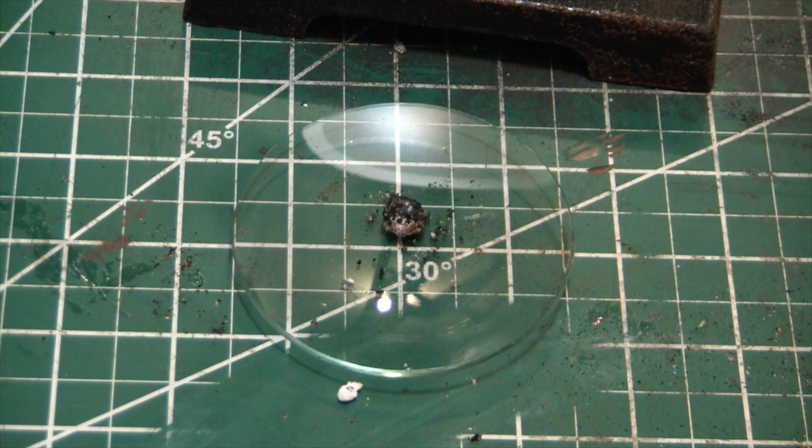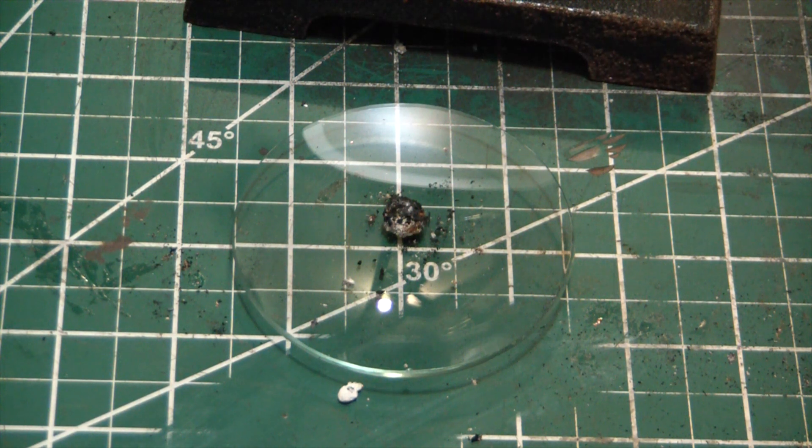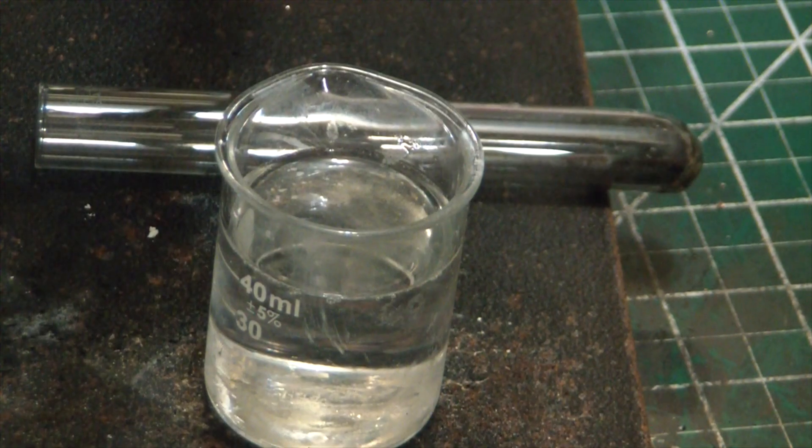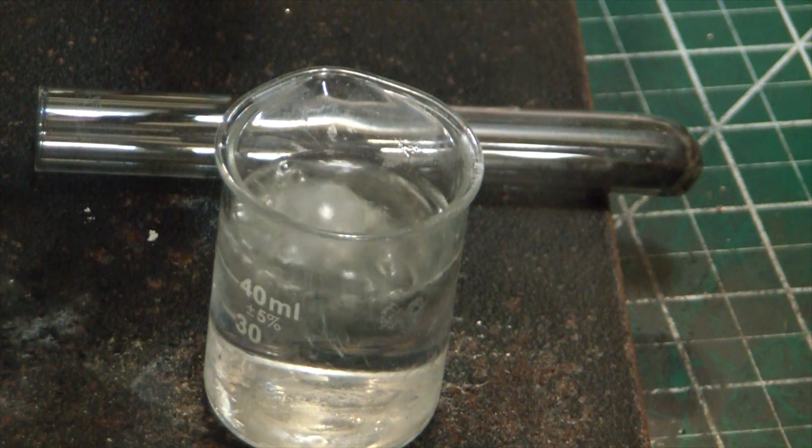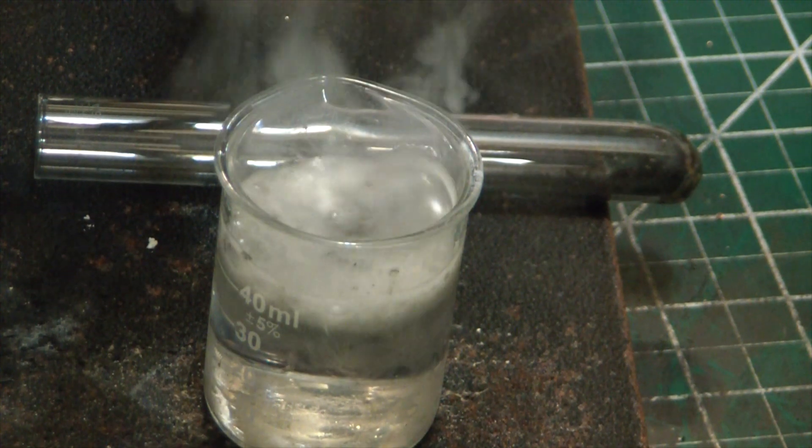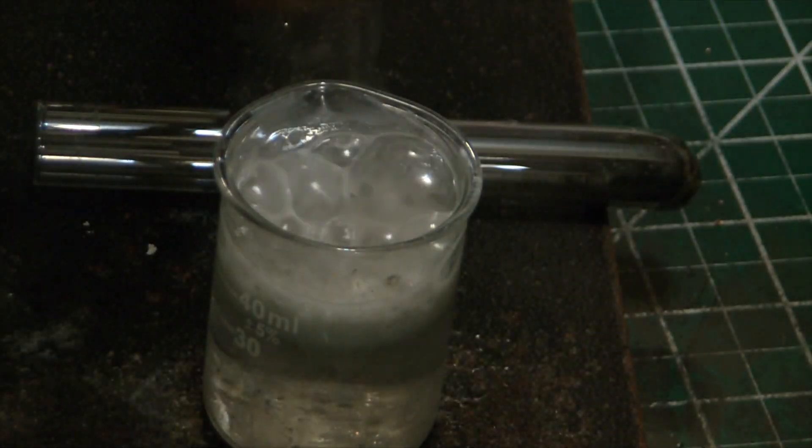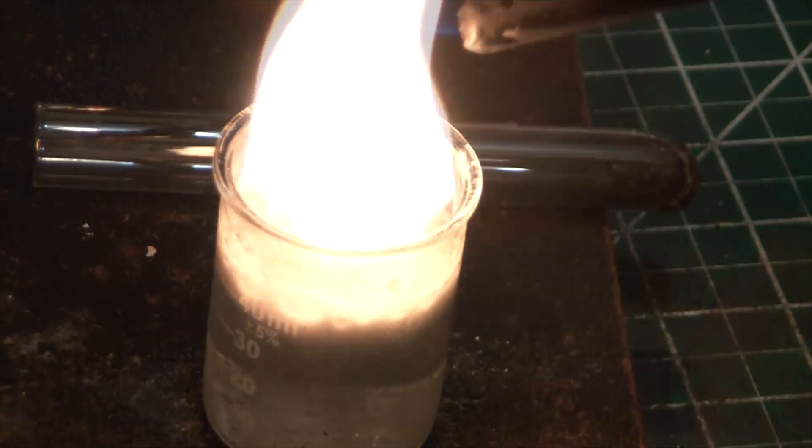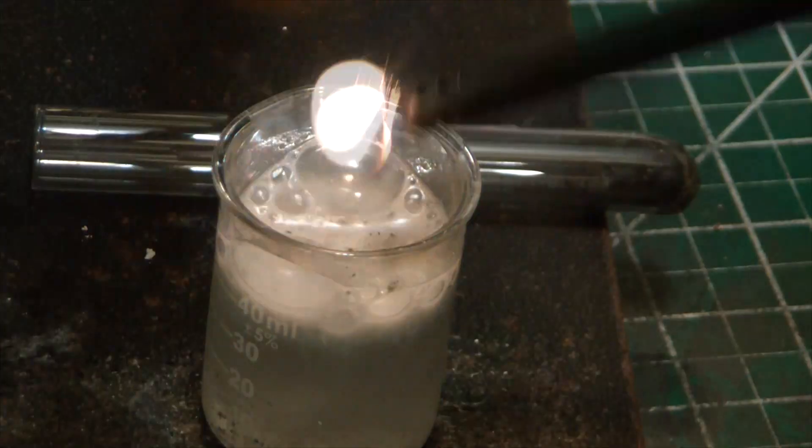That might be enough to get a lamp going for about 10 seconds. Let's see if this little guy reacts. Oh yeah! That's definitely acetylene.